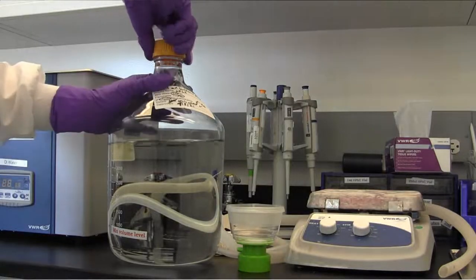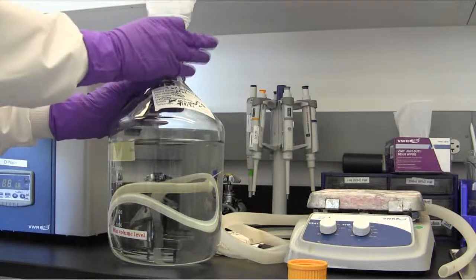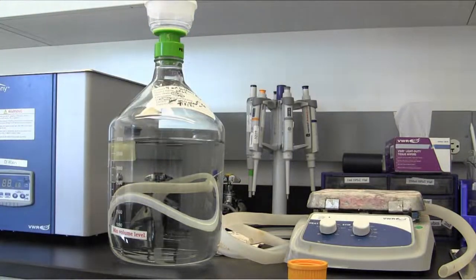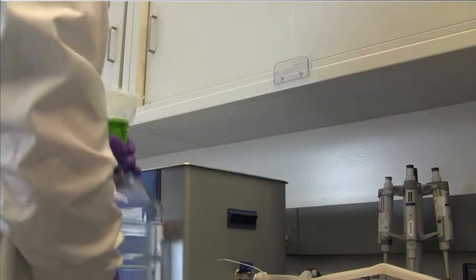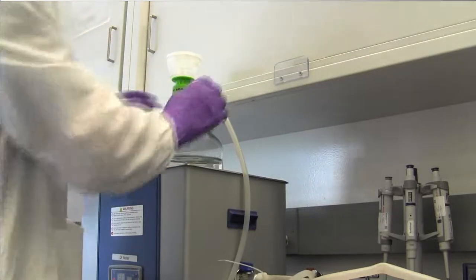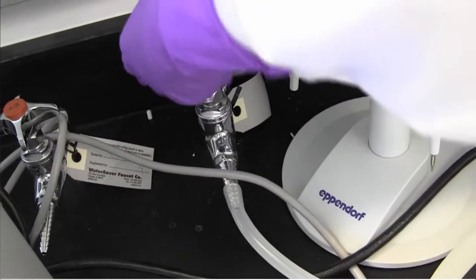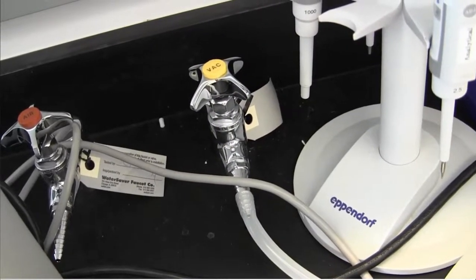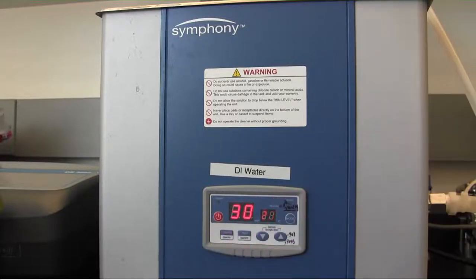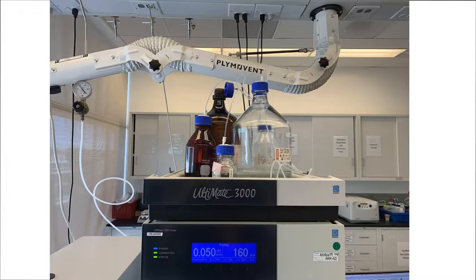First, the eluent bottle is connected to a sterile vacuum bottle filter. Once the filter is connected, the tubing is connected to the vacuum source. Turn on the vacuum and sonicator and allow the mobile phase to be degassed for approximately 30 minutes. Once this process is complete, the mobile phase is ready for use and can be placed atop the HPLC instrument.